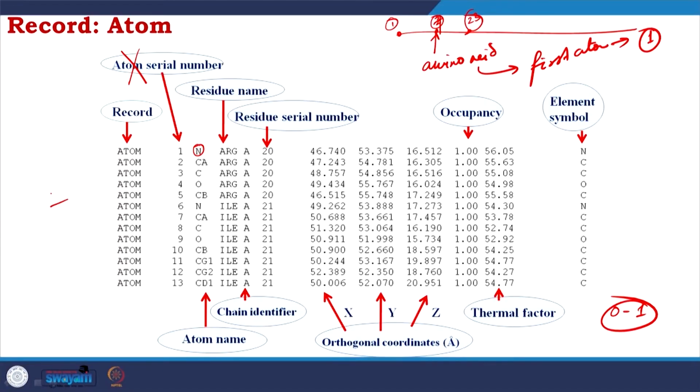Okay. Why is it very interesting, as I told? If your protein's amino acid has altered conformations, suppose you have a serine, CH2OH, and that serine has 2 conformations equally populated, the occupancy would be 0.5, 0.5. If one is more populated, it is 0.7, 0.3. Now, here is a very interesting thing.